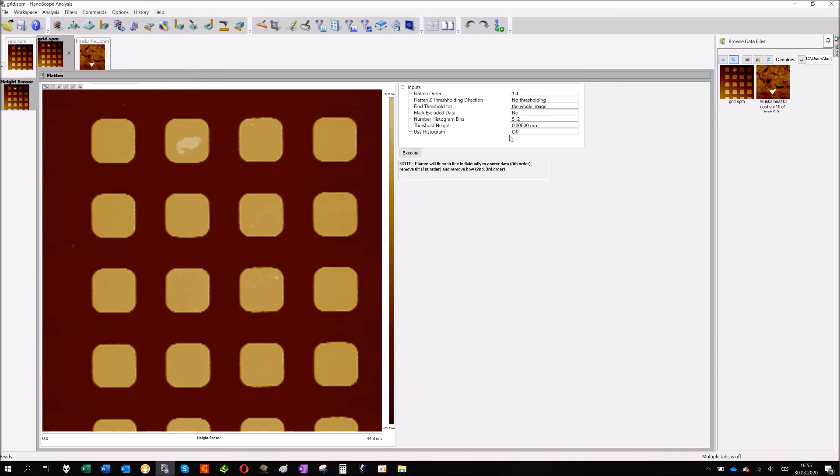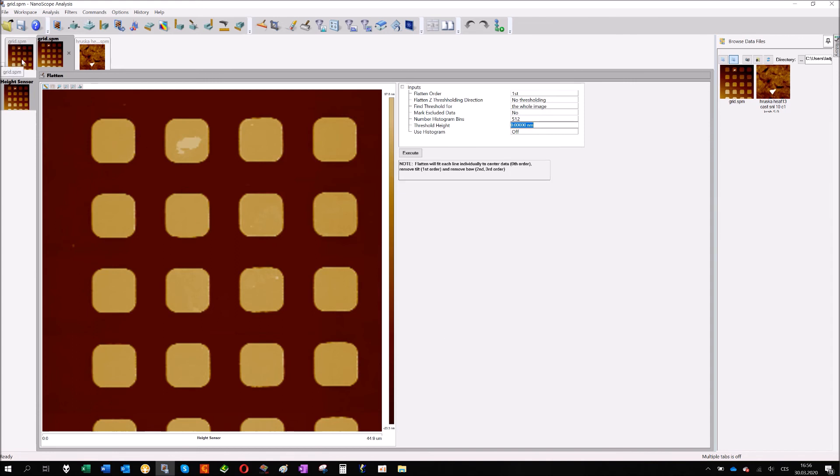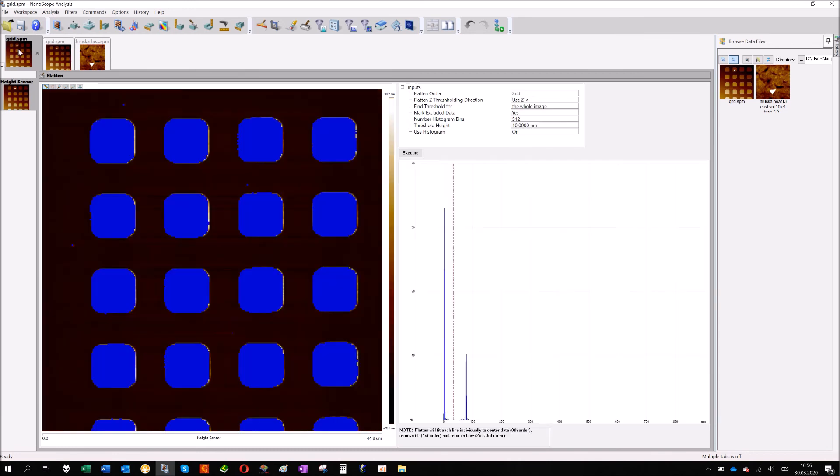Thresholding generally shows you the points which are below or above some limits. You can choose it if it's below or above. You can choose if you want to calculate it for each line or for the whole image. And then you choose the threshold height. This is the number, show me all the data below 10 nanometers height, it will be used for calculation. You can also mark exclude the data or you can use the histogram for measurement. It takes some time for analysis on some computers, which is unfortunately in my case.